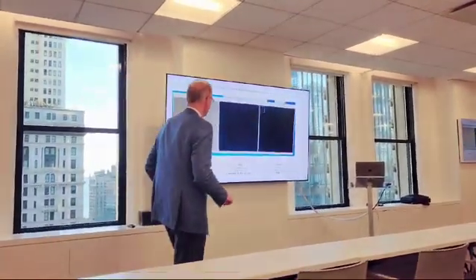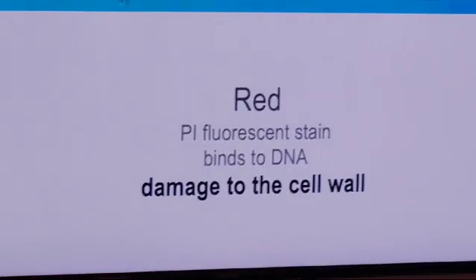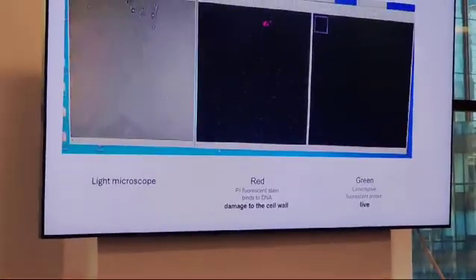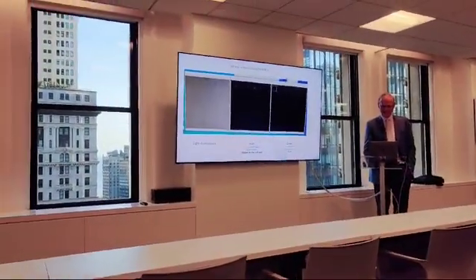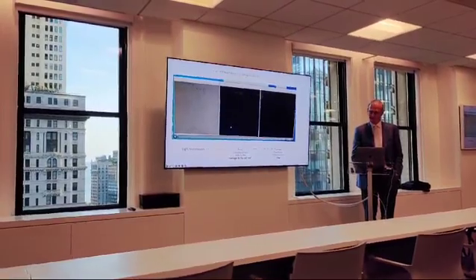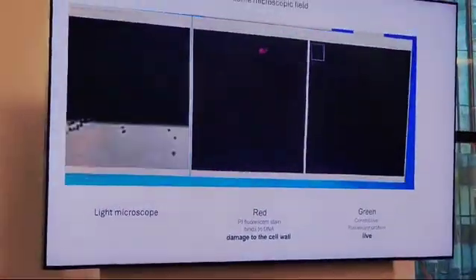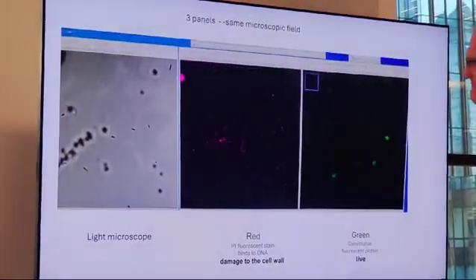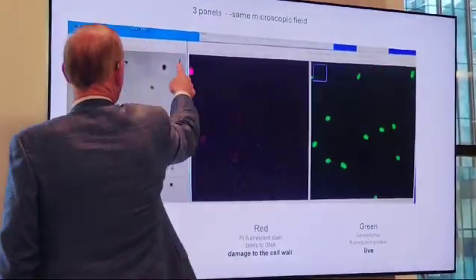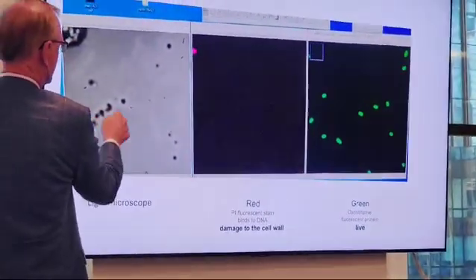Okay, so let's look at this. And it reminds me, by the way the bacteria line up, it's like the Little Dipper in the constellation. They kind of line up that way. So let's just take a look at this and see. I hope I can get this to work. This is about 30 seconds. Not the deep ones, these ones right here.